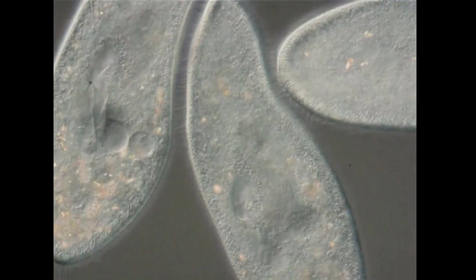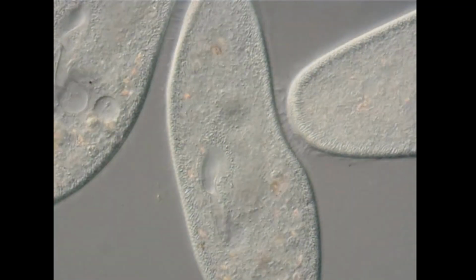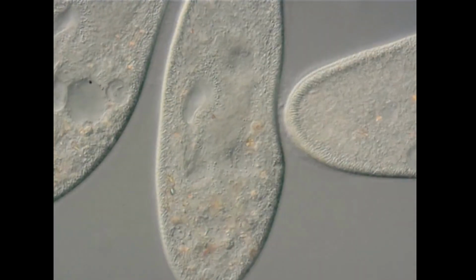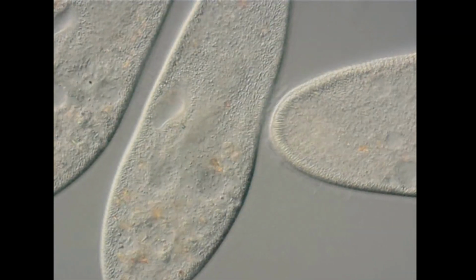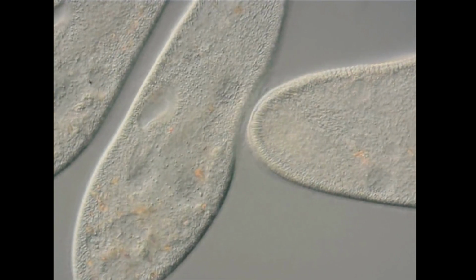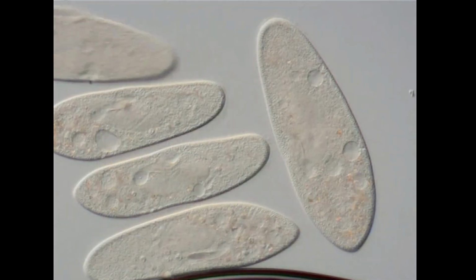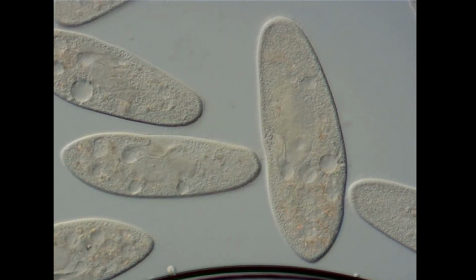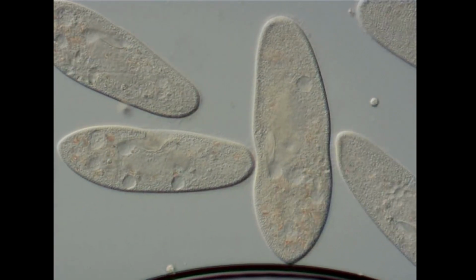The website, the virtual pond tip, will help you to identify it. And again, it takes a while until you learn to see what's actually there, what are the different organisms, are they single cells, are they multicellular organisms, what group do they belong to. But again, it's definitely a hidden world of microbiology under the microscope. Enjoy hunting for little critters.